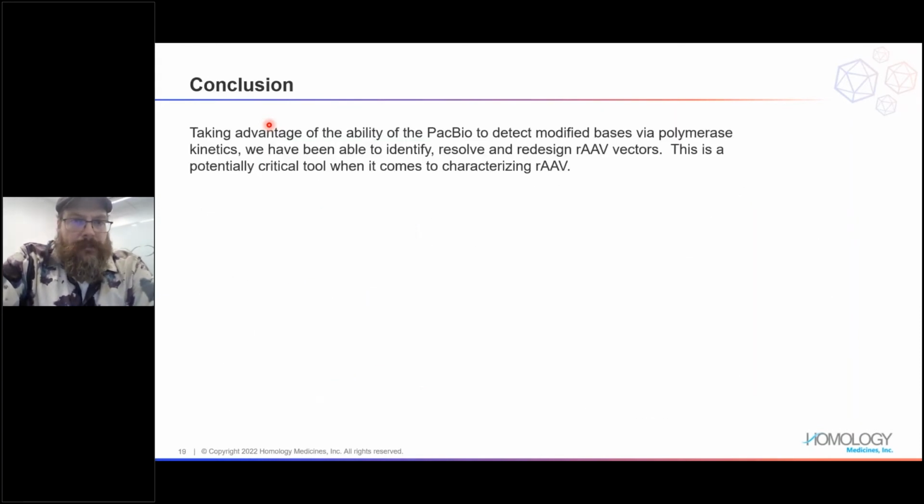So yeah, these are really helpful tools. Obviously, this can really improve your safety profile as far as going to the regulatory agencies and all that. Saying we've confirmed that we've done the best designs that are absolutely possible with our plasmids, and they're ready to be packaged into their capsids. And yeah, it's a godsend, really.